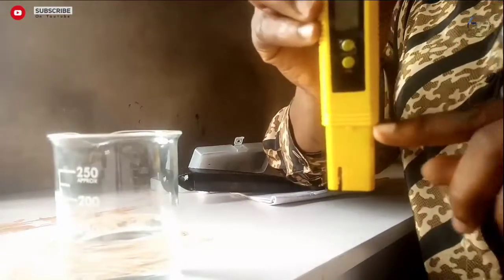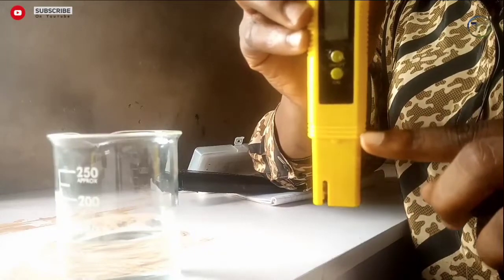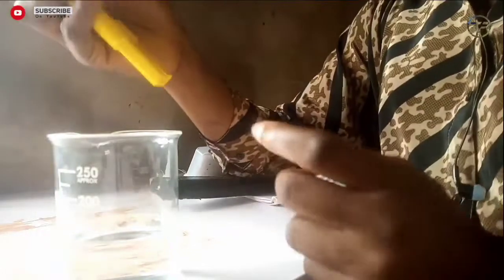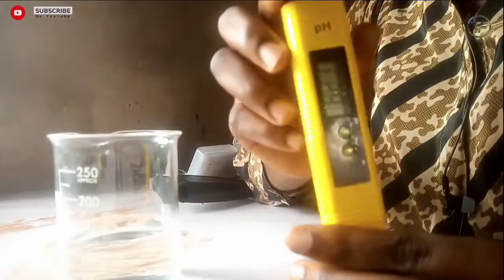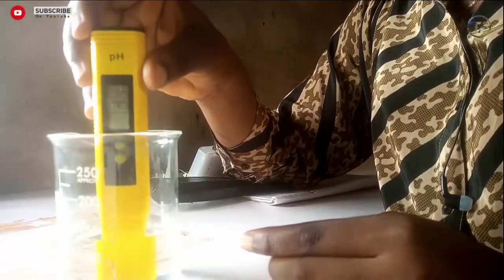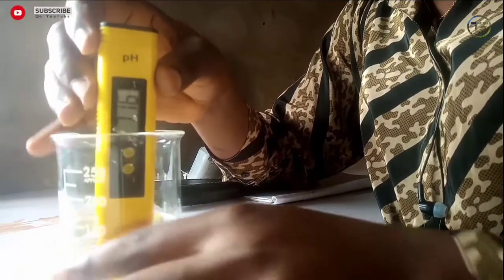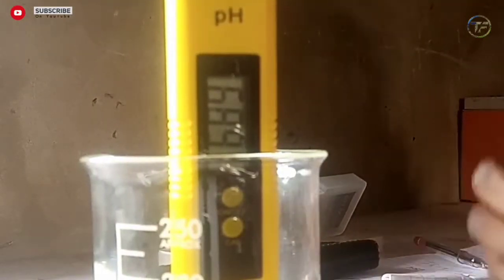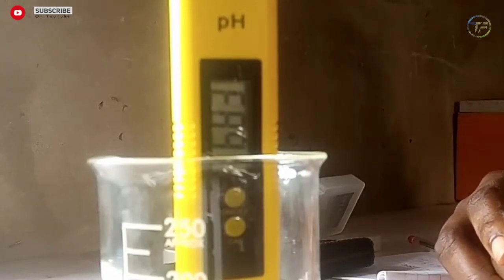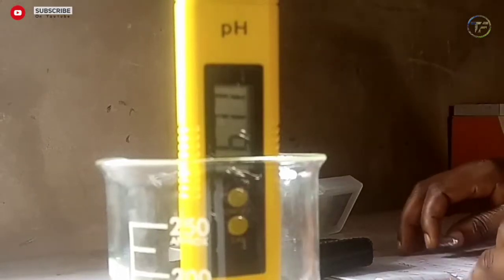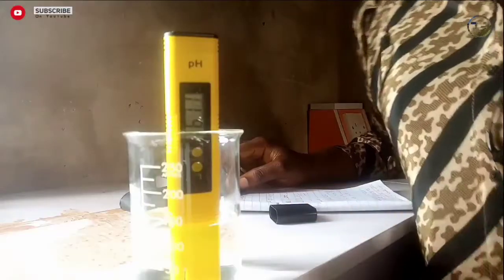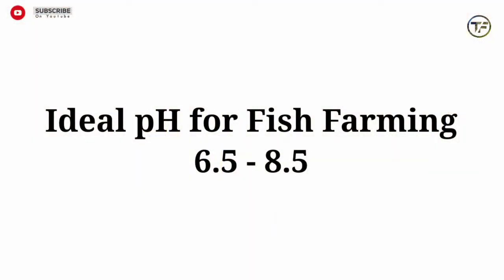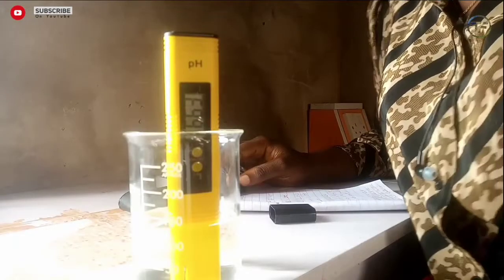You open it like so. There is a mark here — this is the point at which you should immerse your pH meter; it shouldn't go above this point, else you're going to damage it. So let's check the pH of this water. You turn it on, then immerse it in your water and it starts reading. The ideal pH for fish farming should be 6.5 to 8.5. If you get something lesser than 6.5, your water is acidic and you can't use it.